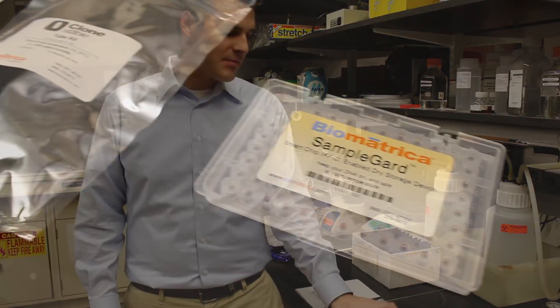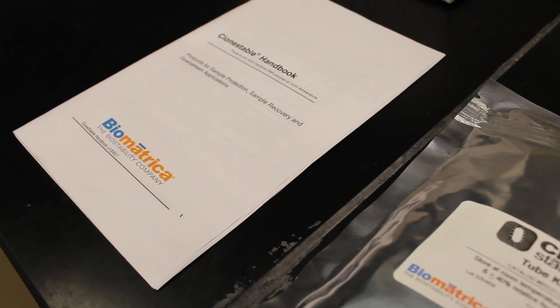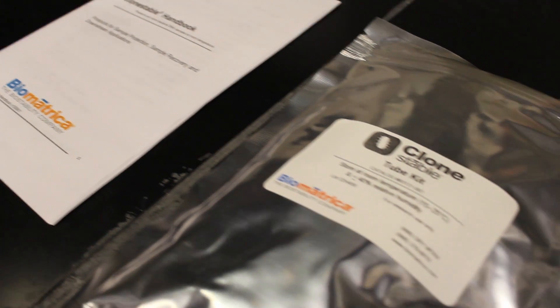We also have the sample guard system. We'll use that for more of our deep archival purposes. Our working stocks are stored as glycerol stocks, but we can keep a backup copy at room temperature in a dehumidified environment without having to refrigerate or freeze.